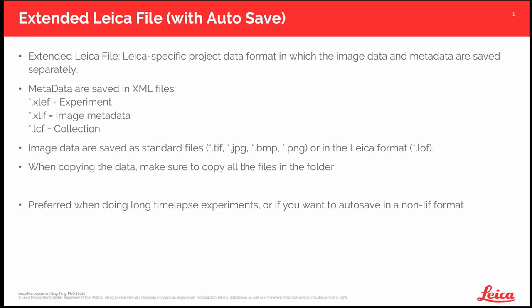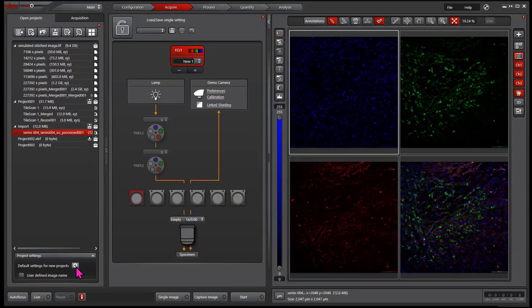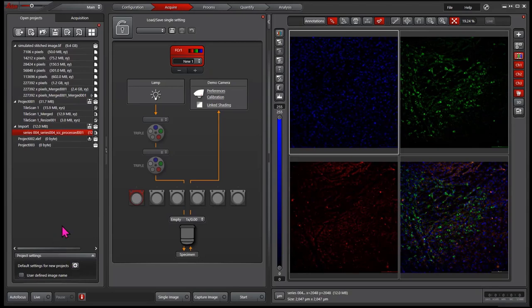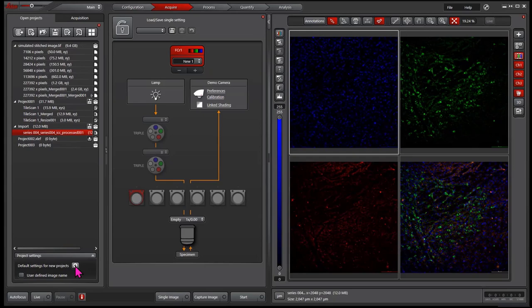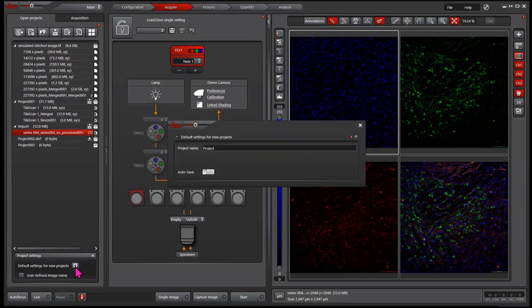How to enable the autosave? In the open project tab at the bottom, enable the project setting, and then click the plus sign.